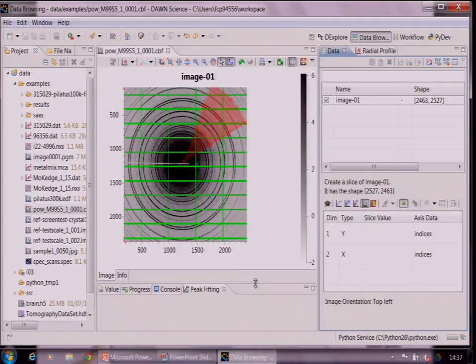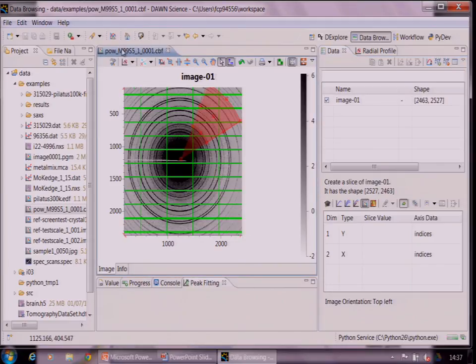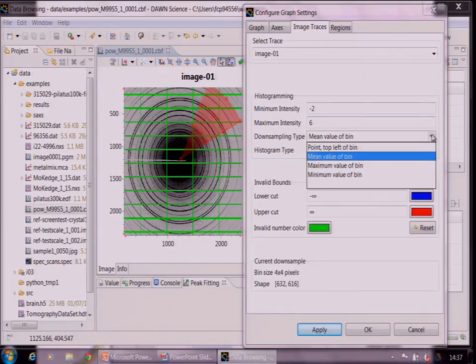Are the transformations still done as custom algorithms, or is there Java Advanced Imaging or anything like that? I don't know. I did some of the Draw2D stuff, and that is basically you have a graphics context, and it's traditional pixel drawing. In terms of this image, obviously it's bigger than the pixels used on screen. So we've got things like downsampling, and we have various options for the downsampling. So if I go in here, you can change it.